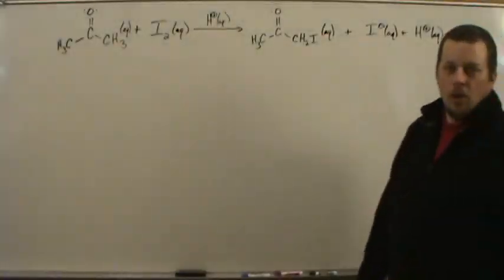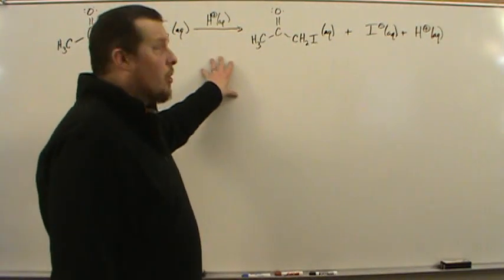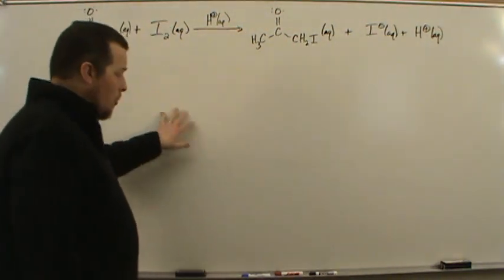So we should take a minute or two now to talk a little bit more about the calculations. Hopefully we're getting a little more comfortable with these calculations, but let's look at them just so that we can be sure. Okay, we've got data to work with. Now, how do we work that data up? Here's the reaction we're working with.